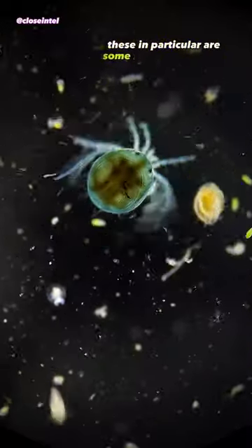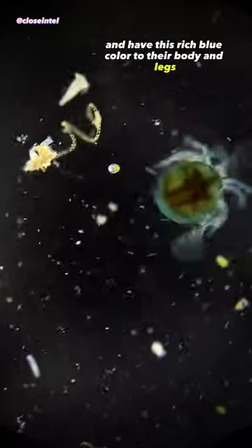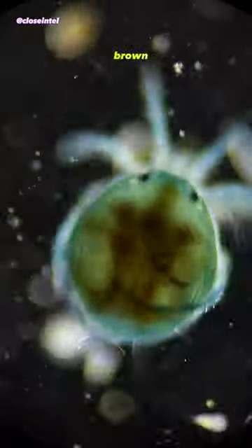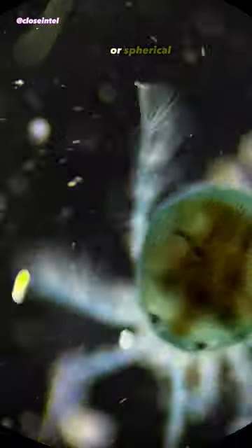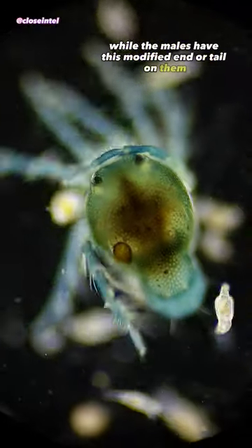These in particular are some kind of Arinurus species and have this rich blue color to their body and legs, but they can also take on a reddish brown or grey color. The females usually have a more rounded or spherical shape to their body, while the males have this modified end or tail on them.